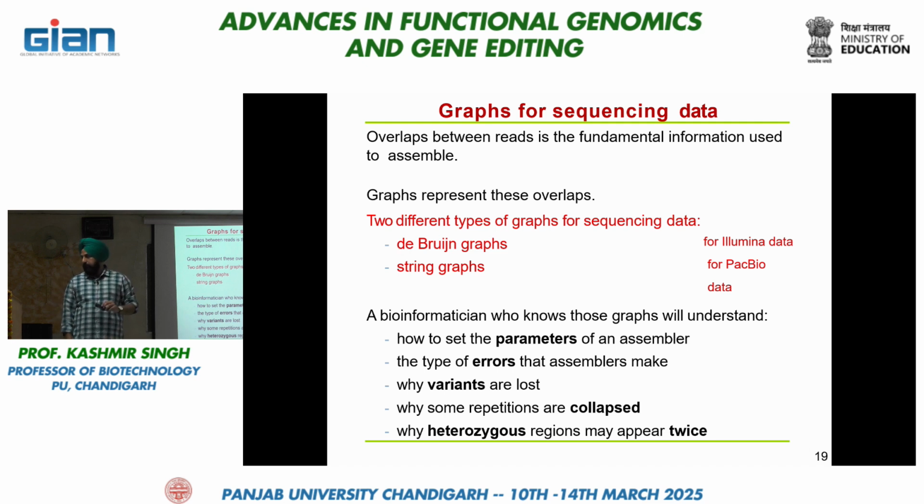So how do you do that? Suppose this is another contig, and you try to overlap this. The sequences that have overlapping sequence will come and align, and then another read will go like this, another will go like this, and you have generation of larger contigs.